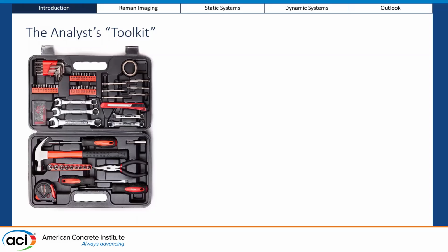If you think about this technique of Raman imaging, I see this as a tool which is right now not in the analyst toolkit, right? So in this case, this is, let's say, an adjustable wrench I just picked up, which could be a potentially useful tool to add to this toolkit. So that's the whole idea, that we have all these amazing tools already. Can we add another tool to understand concrete better?